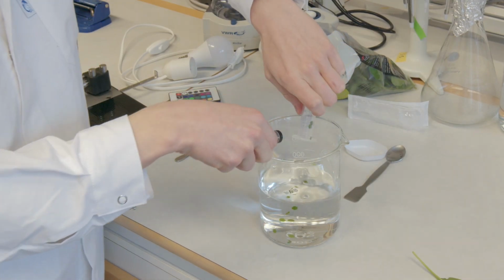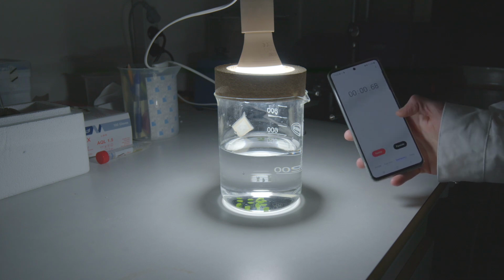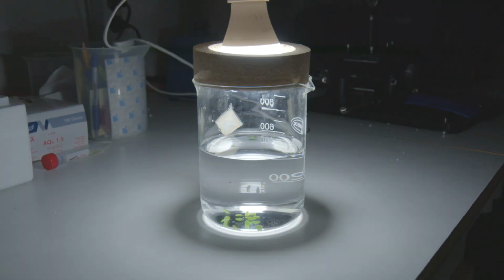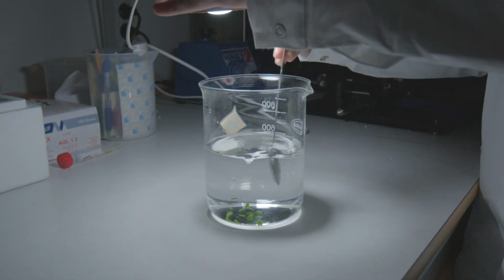Once the discs are in our beaker, we can add our last ingredient, light. We now just need to start a timer, wait for the discs to start floating, and write down what we observe. After every minute, we should write down how many discs are floating, then gently mix the solution to stop the discs from getting stuck on the walls.